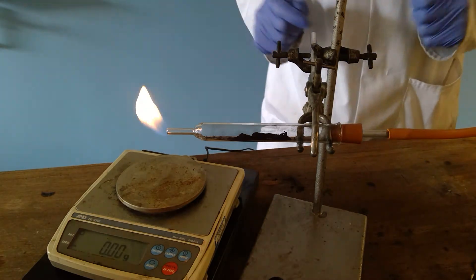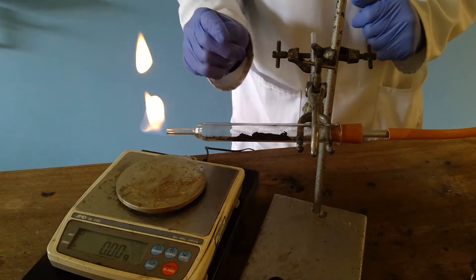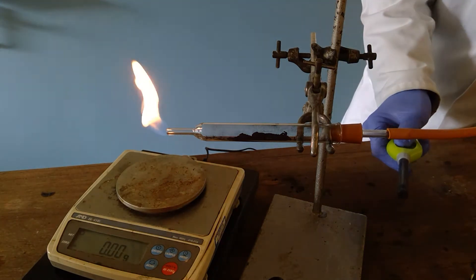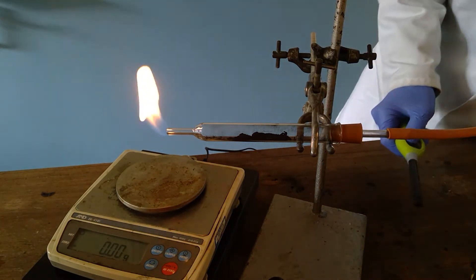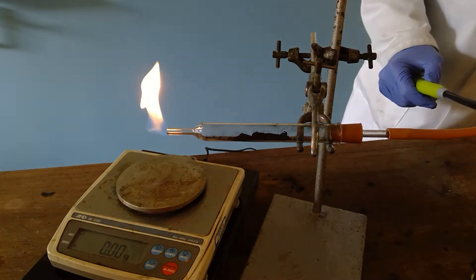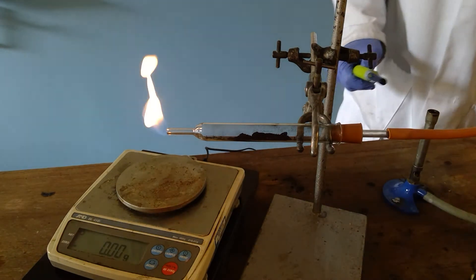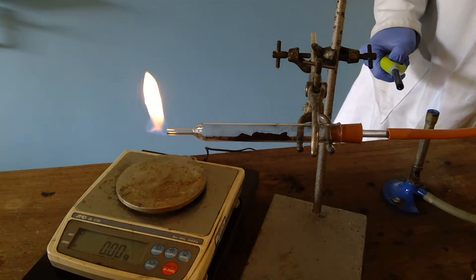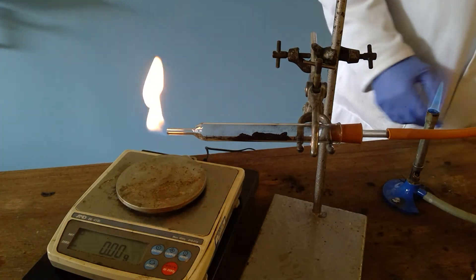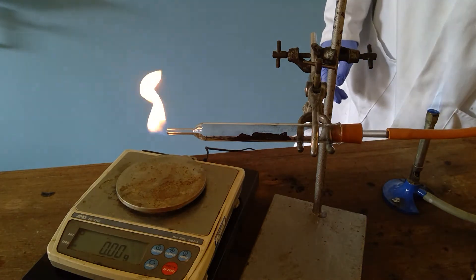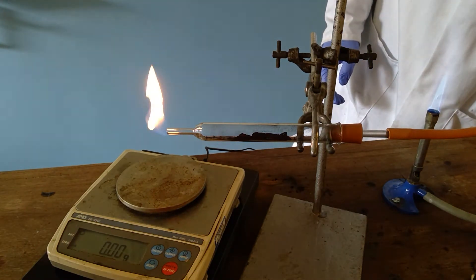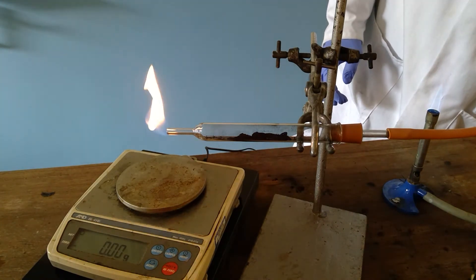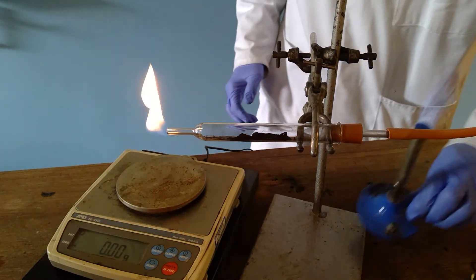The reaction doesn't occur in the cold and so we need to heat the copper oxide. So we will light a Bunsen. Initially we will heat with a small flame but we will build up the heating. So initially a fairly small flame and we will start to heat the copper oxide.